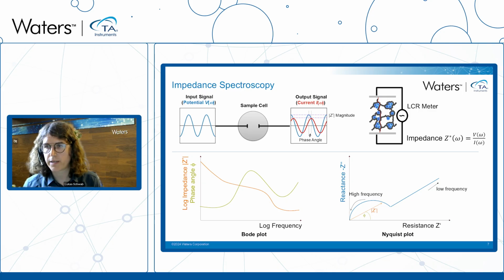So of course, we can measure the impedance of the sample before and after shearing, but still we will not be able to know what's really happening during the procedure. And also, for example, if we really produce the sample and coat it on the current collector, then we cannot measure the slurry afterwards once it's coated.